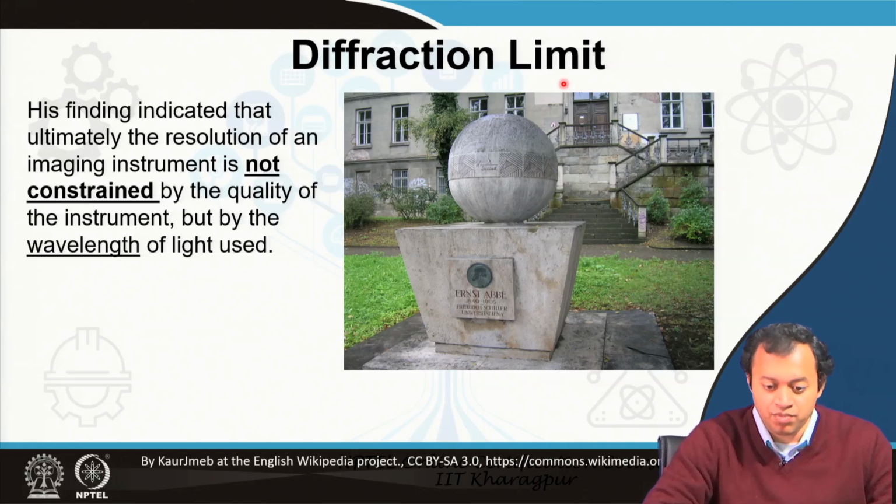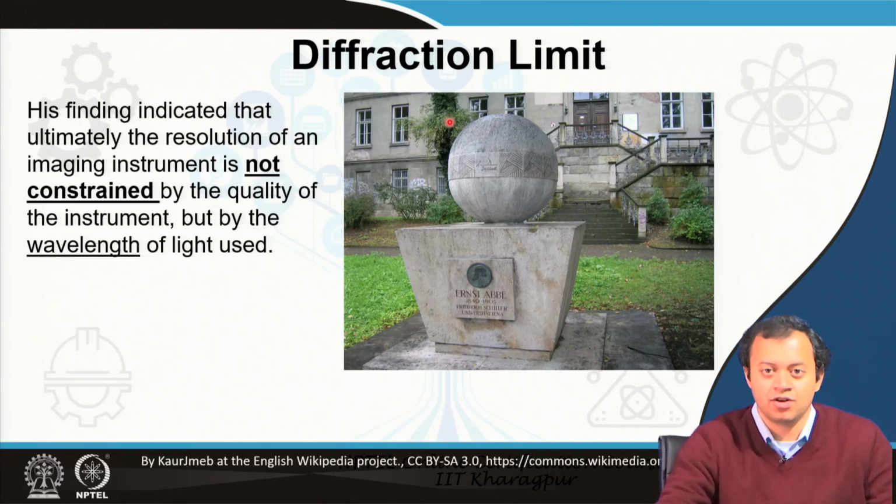Photonics technologies are important because we bypass the diffraction limit. I have done it myself. It is not that I am someone special, any photonics engineer knows how to do it, and that is the point where photonics comes into microscopy.